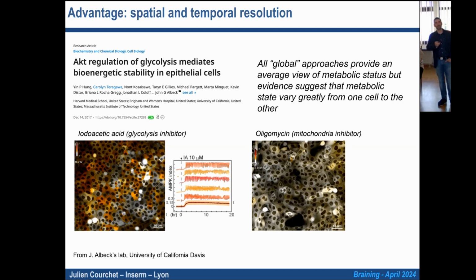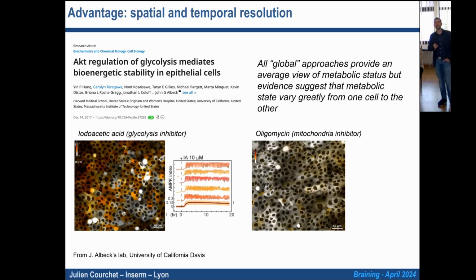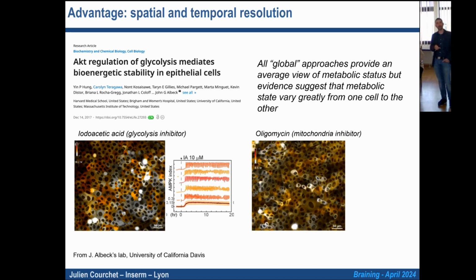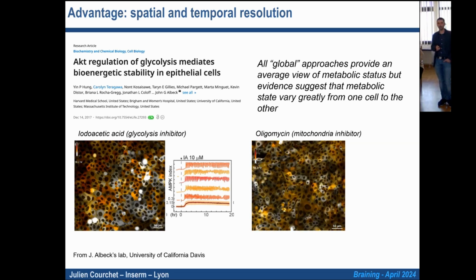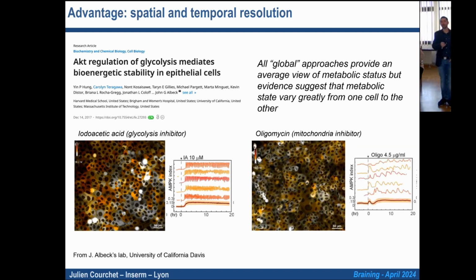Well, depending on what type of metabolic stress you are using, if you use an inhibitor directly for the mitochondria, then you will see that it's not exactly the same. Similarly, you would have activation of AMPK, and you would see single cell activation, not all the cells respond the same, but now on a slower pace, and you would have some cycles of activation and inactivation that are happening differently. So this is the type of oscillations that you will be seeing.